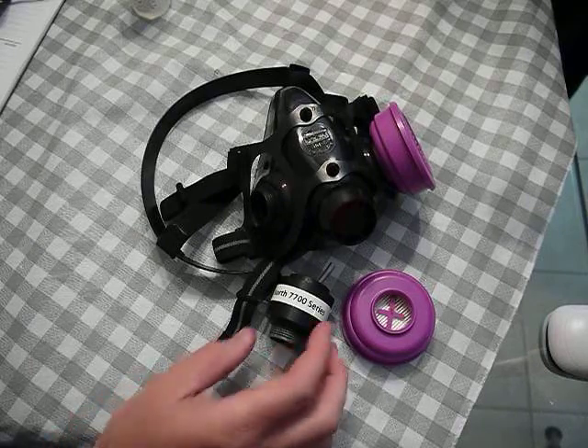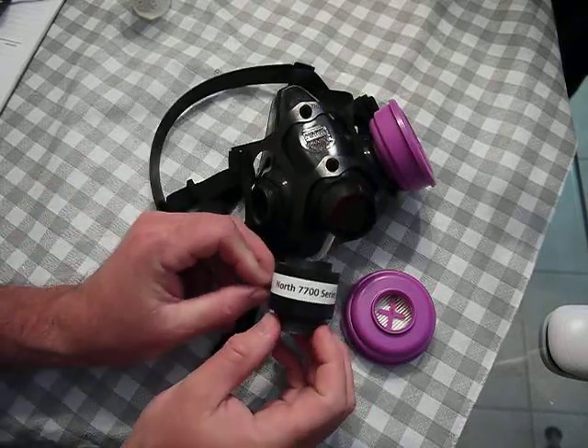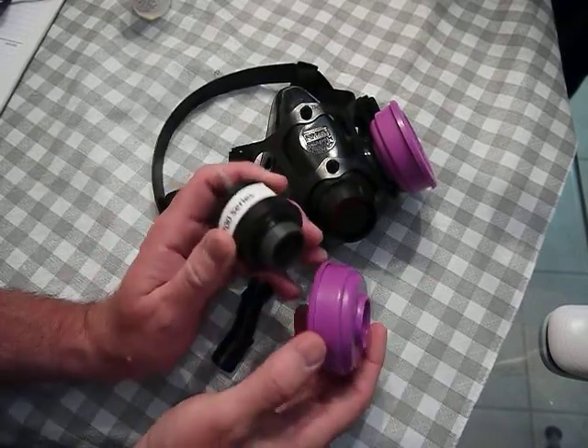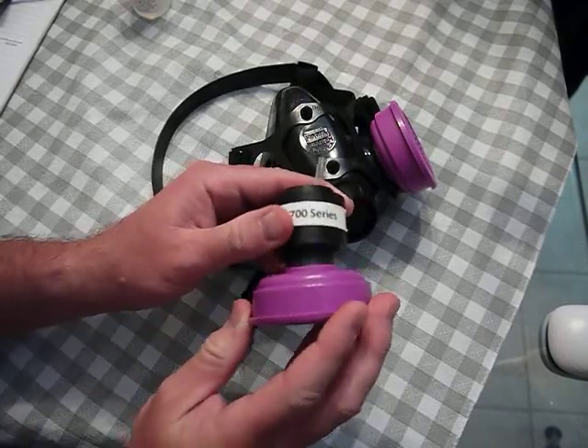This is the fit test adapter for the North 7700 or Honeywell half-face respirator. To do fit testing with this, we would put on our P100 filters.